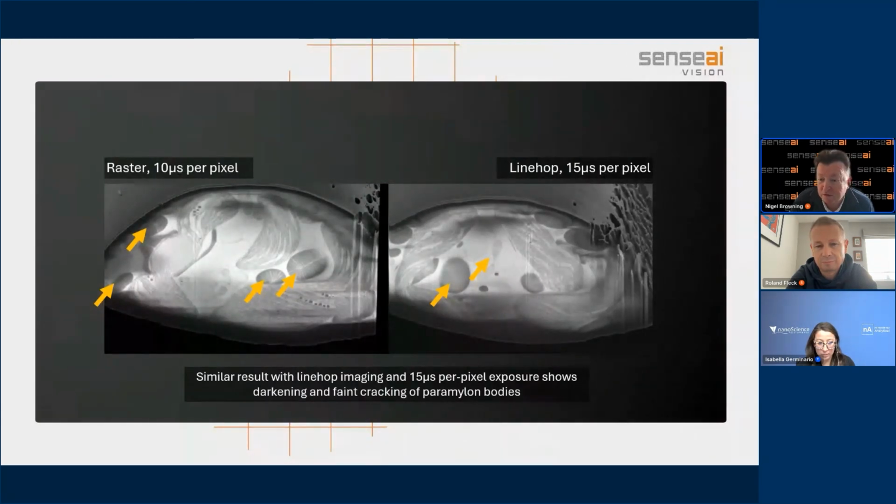You can put it together, you go through the process, and then we use, as Roland said, dictionary learning to do the reconstructions. This is a way of taking the sparsely sampled data sets, understanding what the components of those images are, and then reconstructing them into the full image going forward. And there are various things online. I think previous webinars have shown how to do that, and there are all kinds of different ways to apply the mathematics to get it to work out.